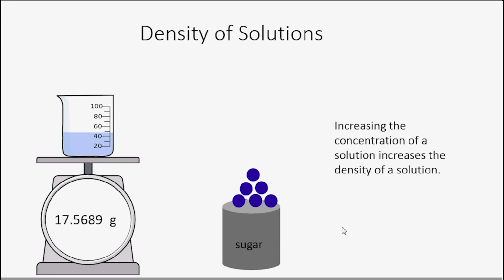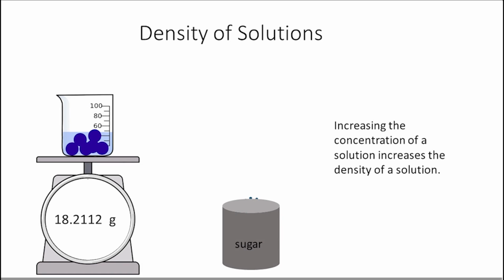In this experiment, you will find the density of soda to determine the concentration of sugar in soda. It is difficult to directly measure the amount of sugar in a sample of soda, but it is relatively easy to measure the density of a sample of soda. Soda is a solution containing mostly sugar as a solute in water, the solvent. As the amount of sugar in a solution increases, the density of the solution increases because sugar is more dense than water, and the more sugar a solution has, the greater its density.